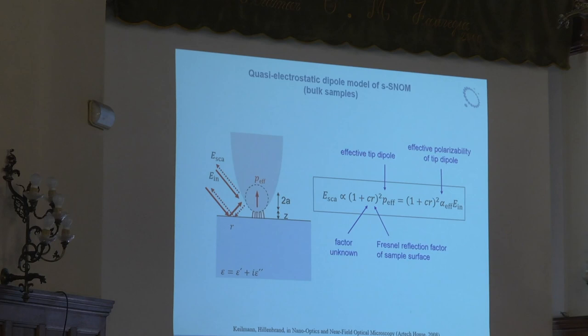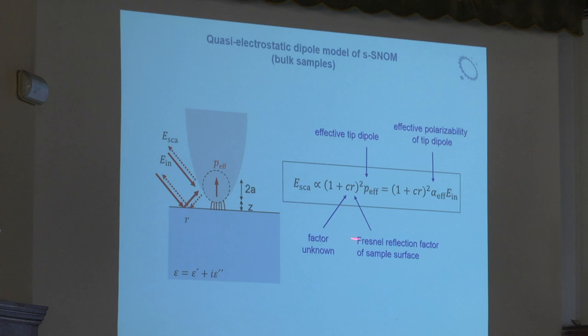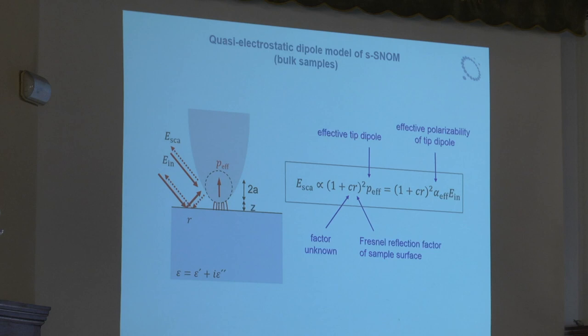It's, let's say, a very simplified picture, of course. But I agree with you that there is diffraction, and this simple drawing is very simplified indeed. But it is indeed a far-field effect, and this far-field effect we can eliminate. And Lars will show this. That is why this is the next thing that I will come up with.